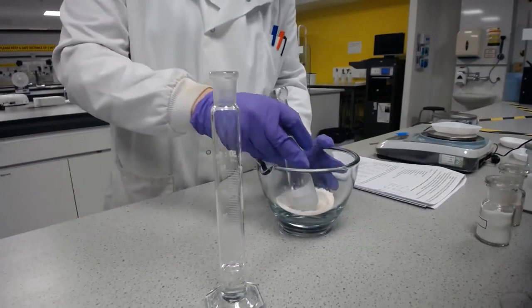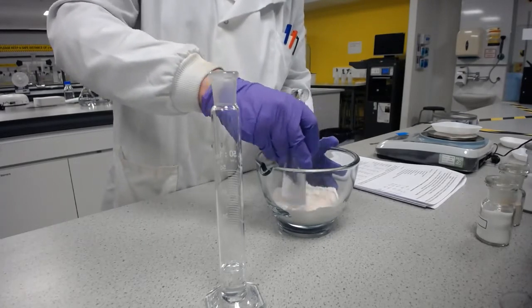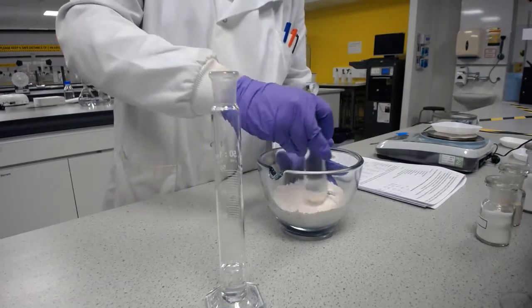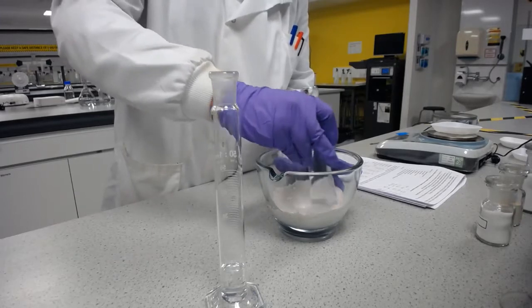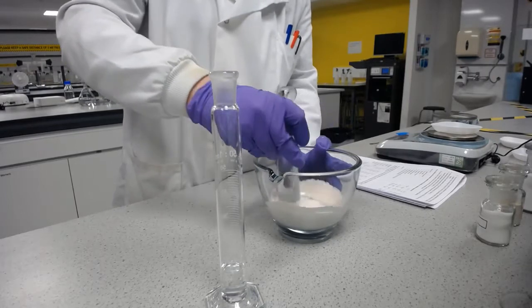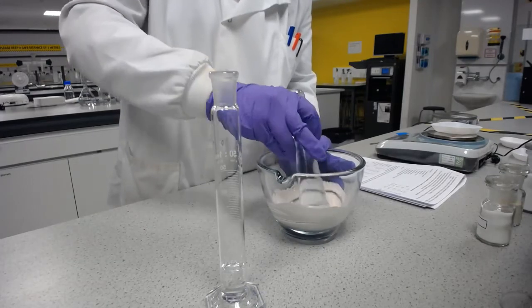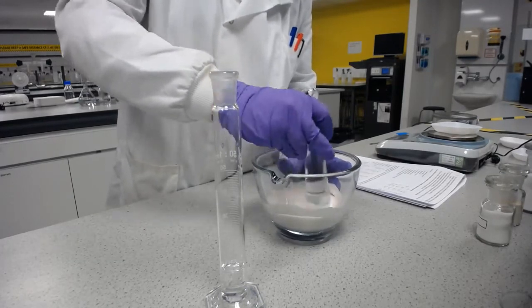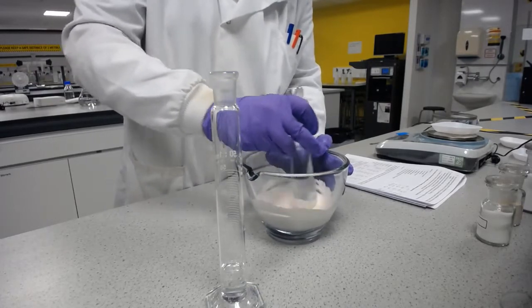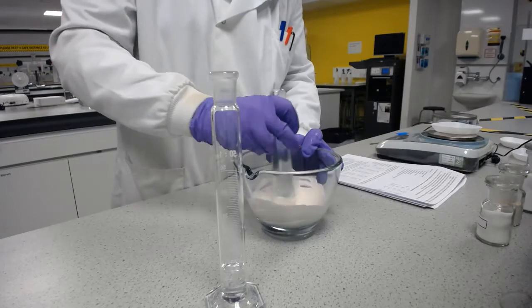And I'm going to make an admixture again. Now again, we're not using a very large force here. All we want to do is get rid of the lumps of powder. So this admixture, this more concentrated mixture than the final one, lumps find it harder to escape away from you, and so you'll have a much easier time at making a smooth, lump-free formulation. And then once you've got it lump-free, you can loosen it off a little bit more, so it's a pouring consistency, and then pour it into the final measuring cylinder.